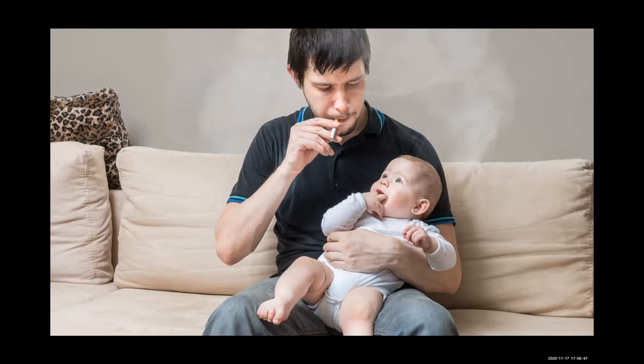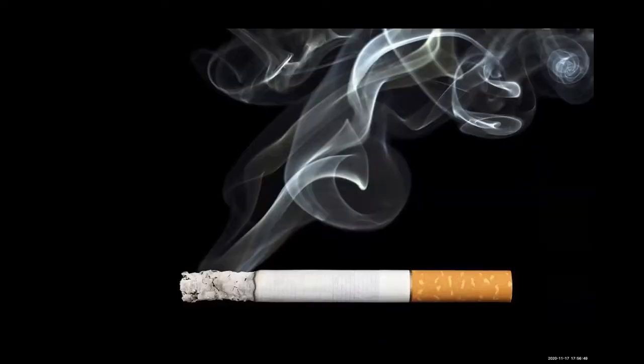You will use a simple apparatus to simulate the smoking process and will collect, weigh, and observe the solid particles produced by burning a cigarette. This will allow you better insight into the quantity and nature of the solids in cigarette smoke.